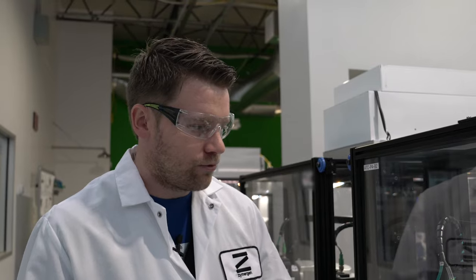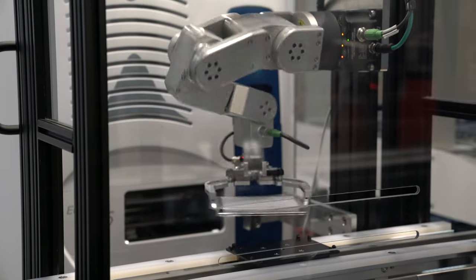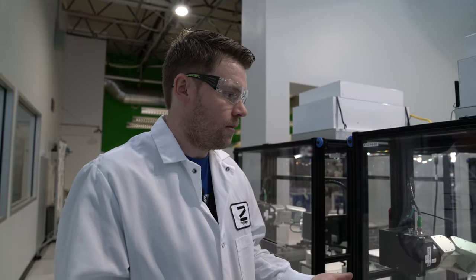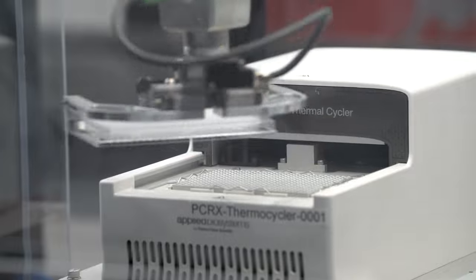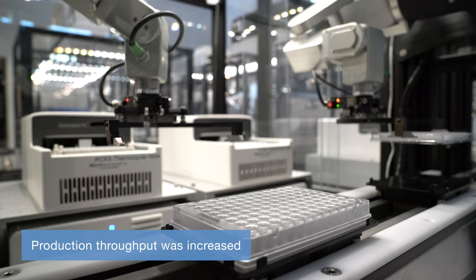We really like this robot because of its compact size. So here we have two Mecca 500 robots that are picking up well plates that feed thermal cycling instruments. We've got in the system one robot per instrument, which allows us to get in theory higher throughputs.